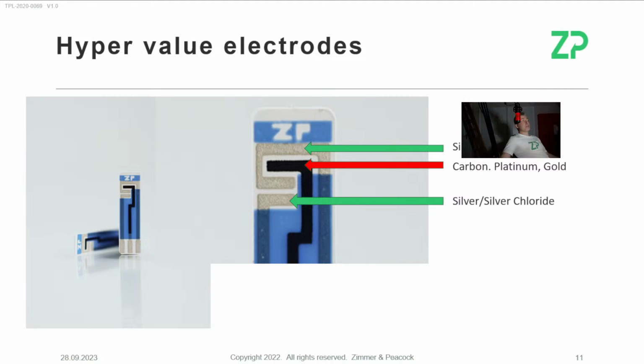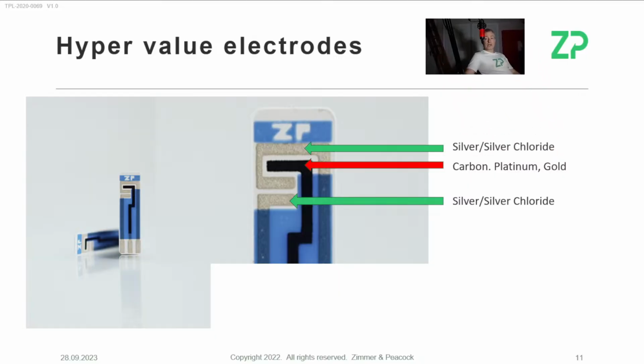I have other videos on this, but it's really important that those material selections are not by randomness. Many people have the counter electrode as some sort of nominal material, like, if the working electrode is platinum, then they make the counter electrode platinum. This is a really bad idea when you make small volume measurements, because you don't know what's happening on the counter electrode all the time. And actually, when the volume is very small, what's happening on the counter electrode becomes really important, because within about 15 seconds, what's happening on the counter electrode can be diffusing to the working electrode.